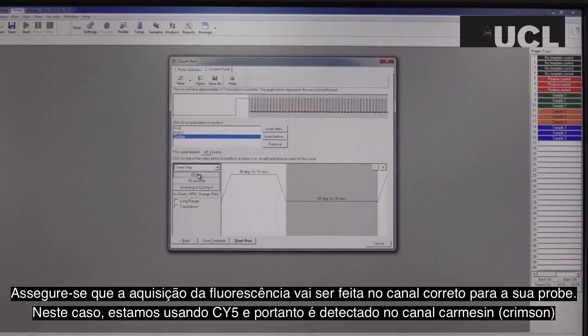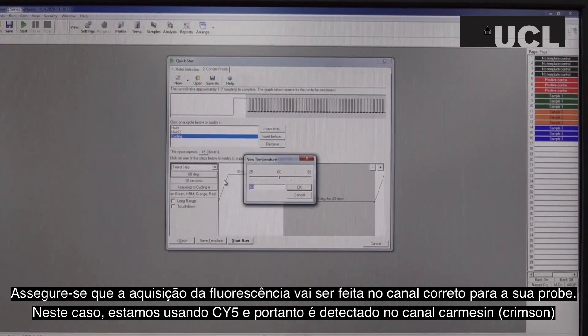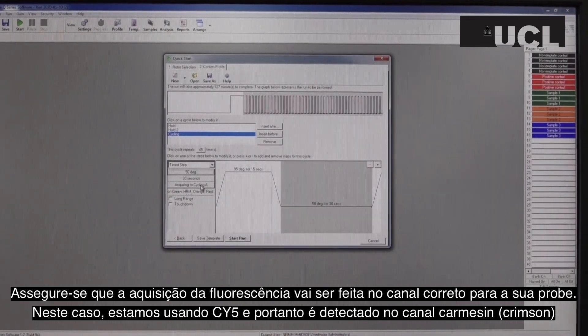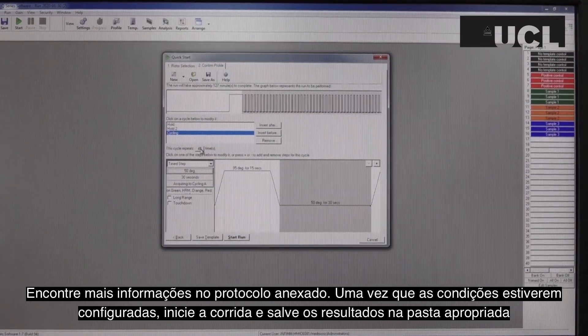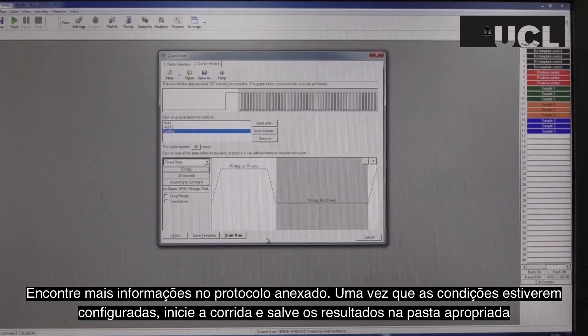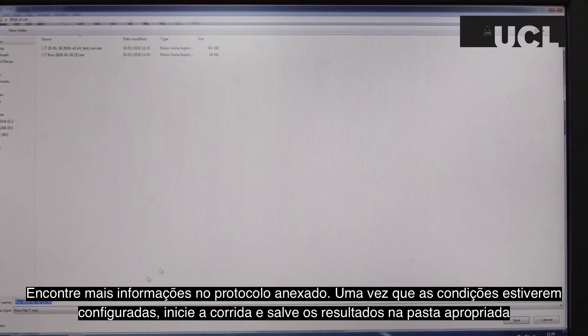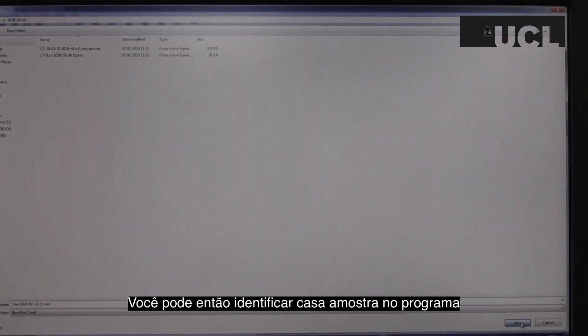Ensure that you are acquiring fluorescence in the same channel as your probe. In this case, we have used sci5 and therefore must detect crimson. Refer to the accompanying PDF protocol for more information on probes. Once the conditions are set up, run the cycle and save the results to an appropriate folder. You can then label each of your samples in the program.